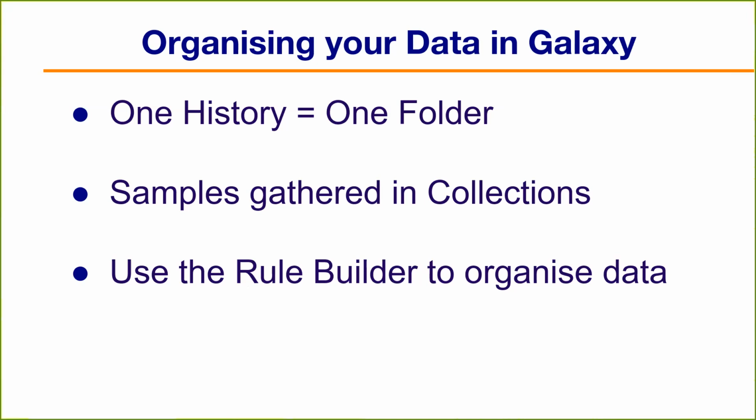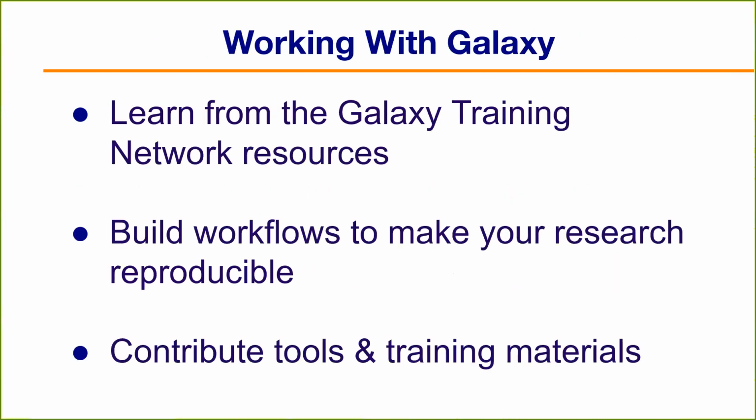I'm raising these things because you have to think about data hygiene at the start of how you're organizing your analysis. So keeping your data cleanly organized. And then how are you going to learn how to work with Galaxy?